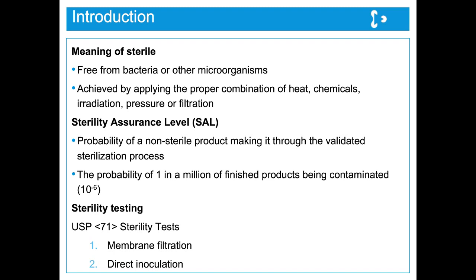Therefore, the sterility assurance level is utilized, which is known as SAL. SAL is the probability of a non-sterile product making its way through a validated sterilization process. The FDA requires that you cannot have more than one non-sterile product in a million making its way through a sterilization process.